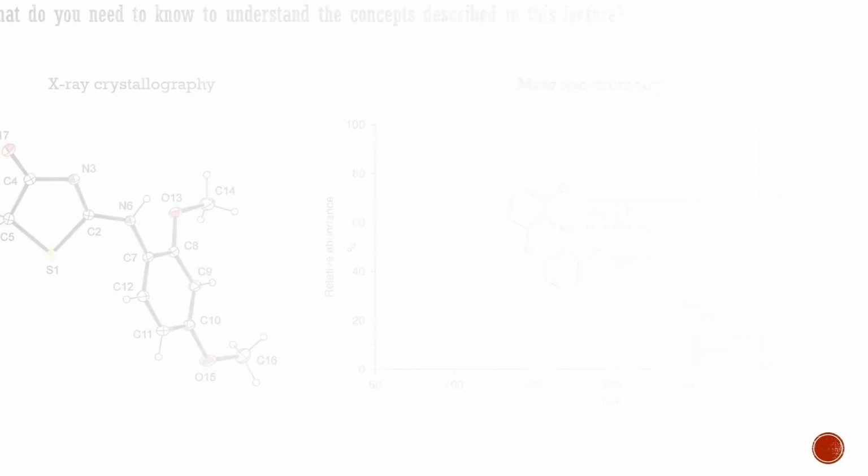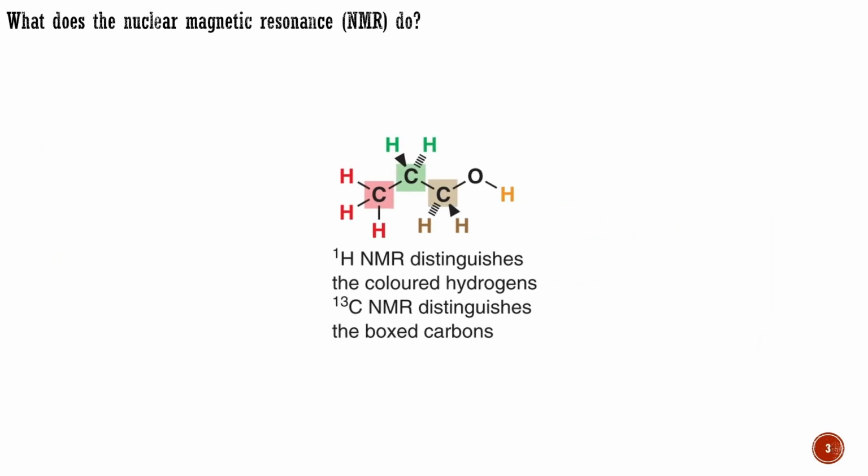Nuclear magnetic resonance, NMR, allows us to detect atomic nuclei and say what sort of environment they are in within the molecule. In a molecule such as propanol, the hydrogen atom of the hydroxyl group is clearly different from the hydrogen atoms of its carbon skeleton. It can be displaced by sodium metal, for example.